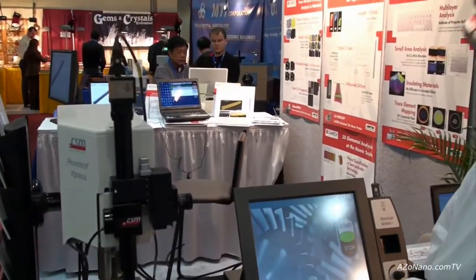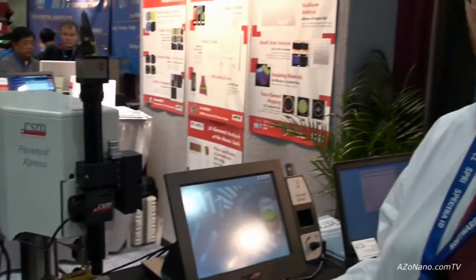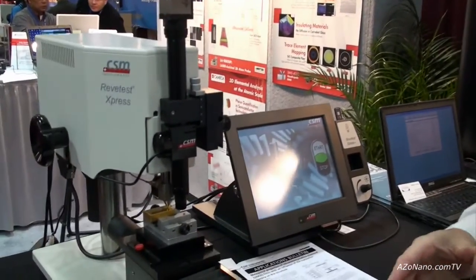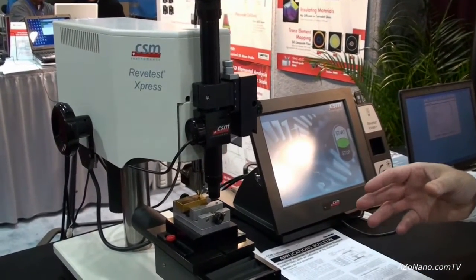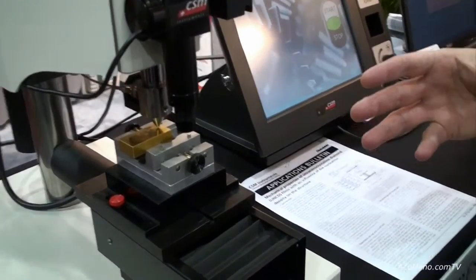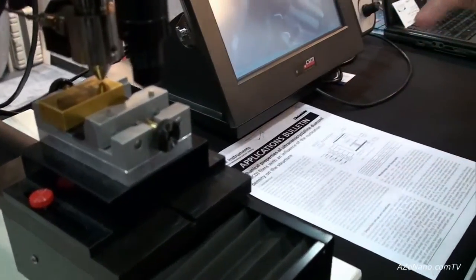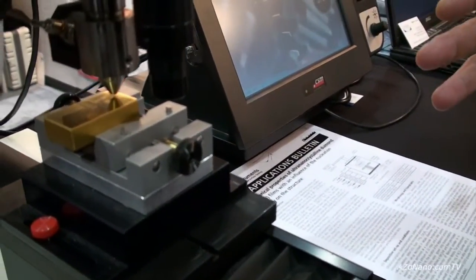So this is the Revitest Express which is our quality control line of instrumentation. What is particularly special about this is that it's based on our world-renowned Revitest scratch tester but this is a simplified version specifically for industry.